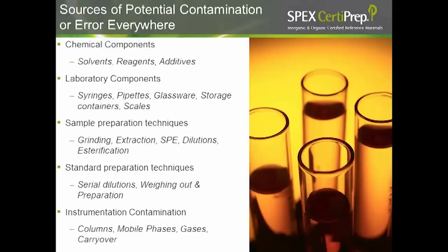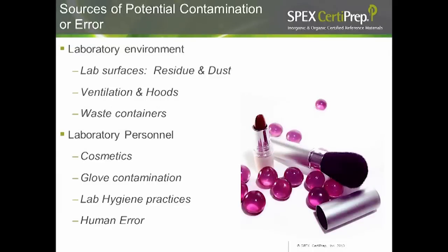Potential sources of contamination or error are everywhere in the lab — from chemical components including solvents, reagents, additives, and raw materials, to laboratory components like syringes, pipettes, and glassware. The way you prepare your samples can add contamination and error. Instrumentation components such as columns, mobile phases, gases, and carryover are also sources. Less obvious sources include lab surfaces with residue and dust, ventilation and hoods that can poorly circulate air, the location and cleanliness of waste containers, and lab personnel — the cosmetics they use, the type of gloves, and human error.